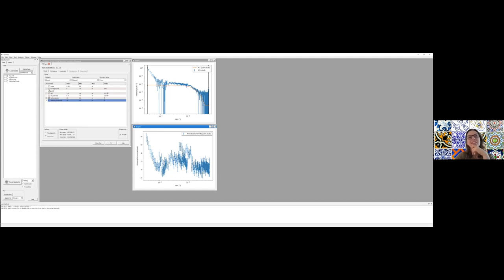So it's kind of noisy data, as you would expect for a very dilute small protein solution. When you're going to do your fit, you have to decide which Q range you're going to use. Now, I don't know what happened there. My guess is that there's probably air bubbles in the solution, so it's contributing to this low Q regime, because we're only at 1 mg/mL, so I didn't expect aggregation. And then it gets noisy here again as it flattens out to the background.